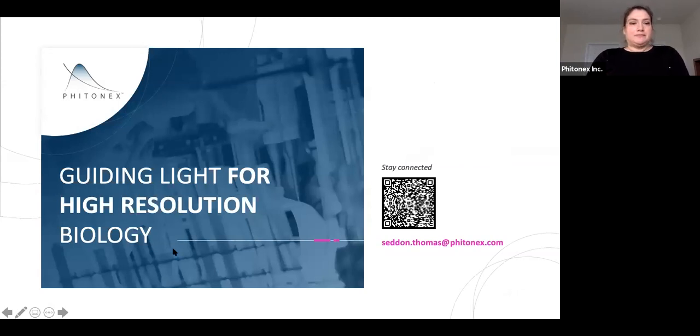All right, how do you control for the number of phytons bound to the antibody? Good question. The point is that we're actually controlling with the oligo conjugation. In that first step, we're controlling based on the amount of antibody and the amount of oligo and the specifics of the chemistry, how that conjugation is occurring. Because the phytons are then added based on this matching oligo strand, controlling the oligo conjugation to the antibody is really that critical step.